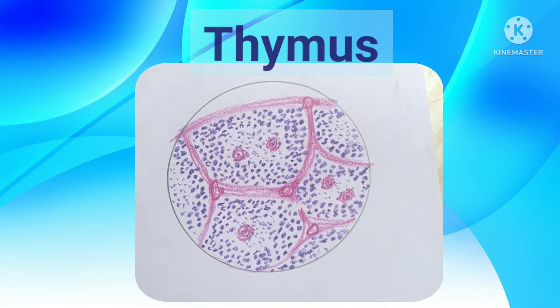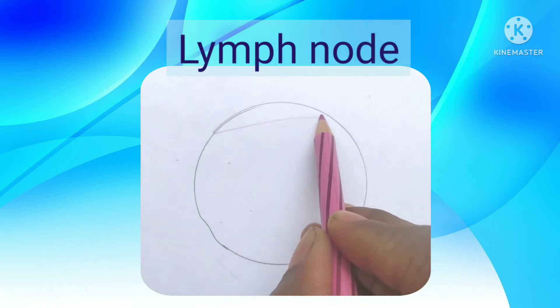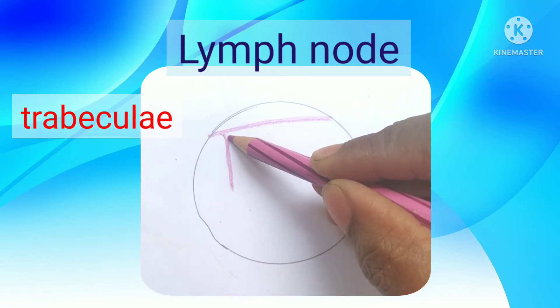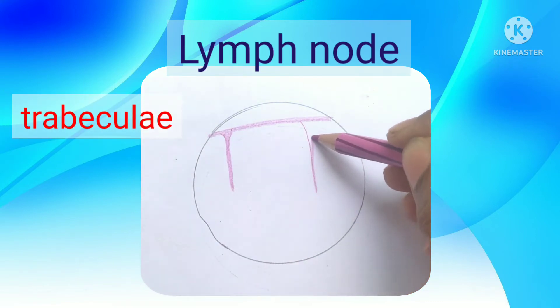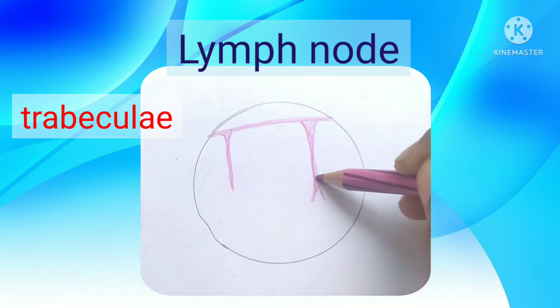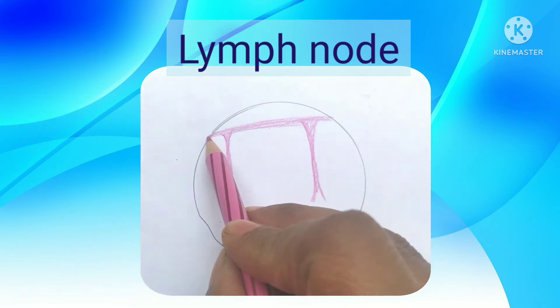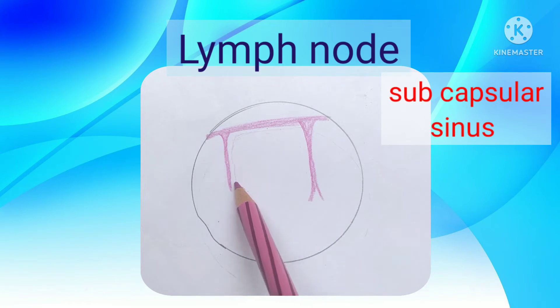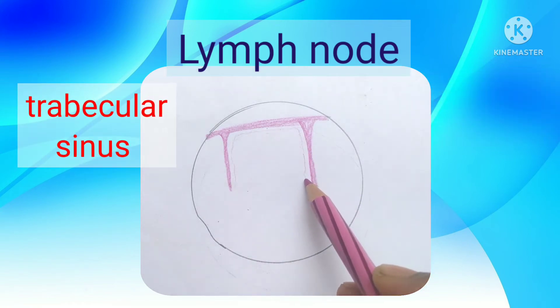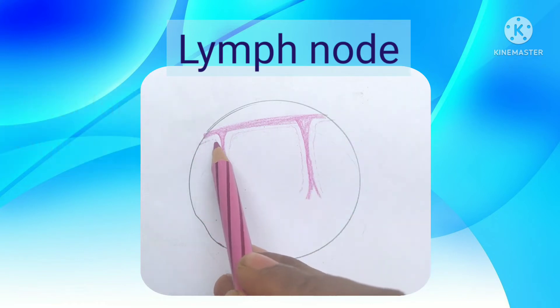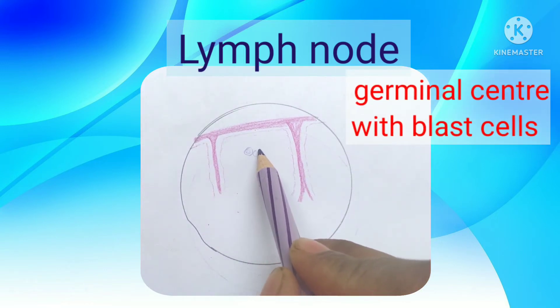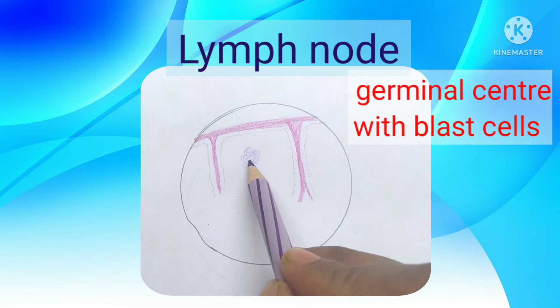Now the lymph nodes - they are small bean-shaped encapsulated lymphatic organs. The size may vary from one millimeter to centimeters. They serve as a filter for the lymph coming from the afferent lymphatic vessels. They are covered by a capsule which sends septa called trabeculae. Beneath the capsule, we have small sinuses called subcapsular sinuses, and just beneath the trabeculae they are called trabecular sinuses.